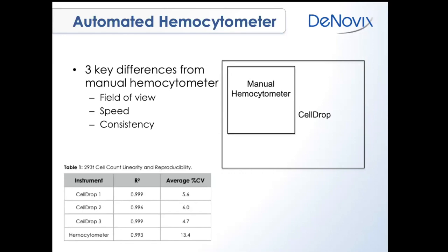And also using automated hemocytometers with pre-programmed algorithms to count is going to be more consistent than if you have a person who, day to day, might slightly vary how they count. Say it's Friday evening, like it is for you folks there. They might be looking to get through the count pretty quickly so they can finish seating their plate and get home. With an automated hemocytometer, you don't have that kind of an issue because the count is going to be consistent every single time.